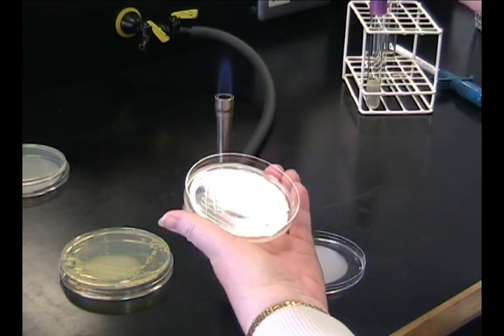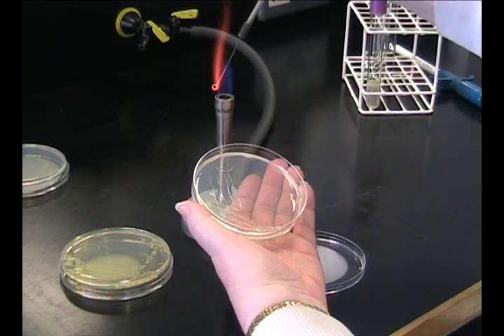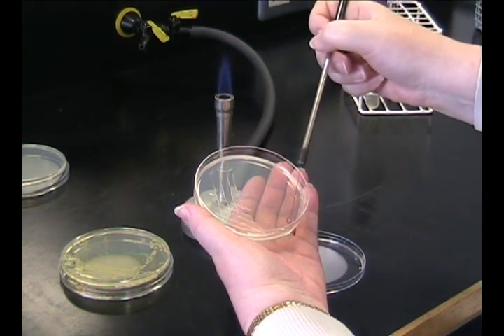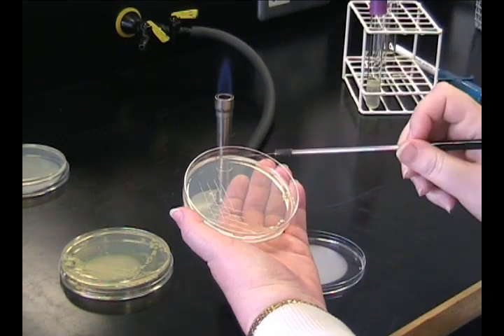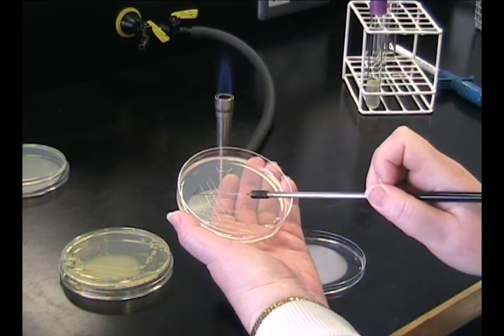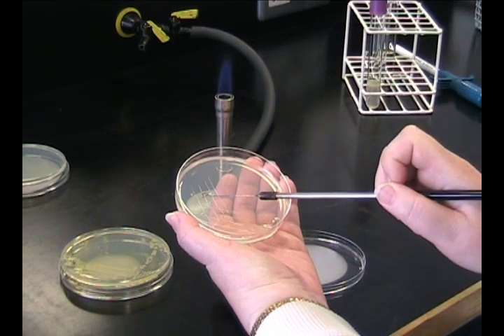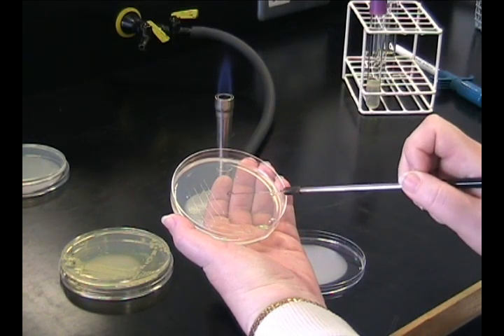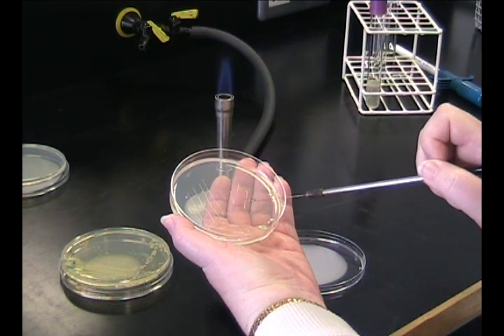At each point where you rotate the plate, you need to cool, flame and cool your loop. By doing this, you are diluting the number of bacteria that are on the loop and therefore reducing the amount of bacteria across the plate. Finish with a streak down the center of the plate.